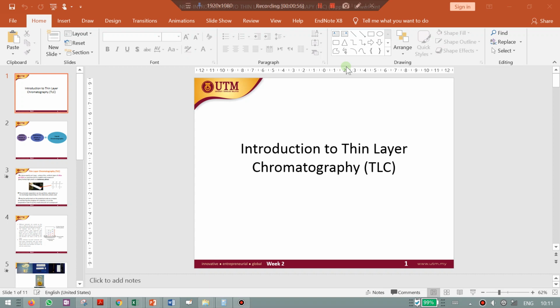Okay, in Malaysia, the requirement for Jabatan Kimia Malaysia is that you need to have at least two types of techniques for any identification or any analysis. So what Jabatan Kimia have done is they apply, first, a screening technique, and second, a confirmatory technique. So they combine them together.